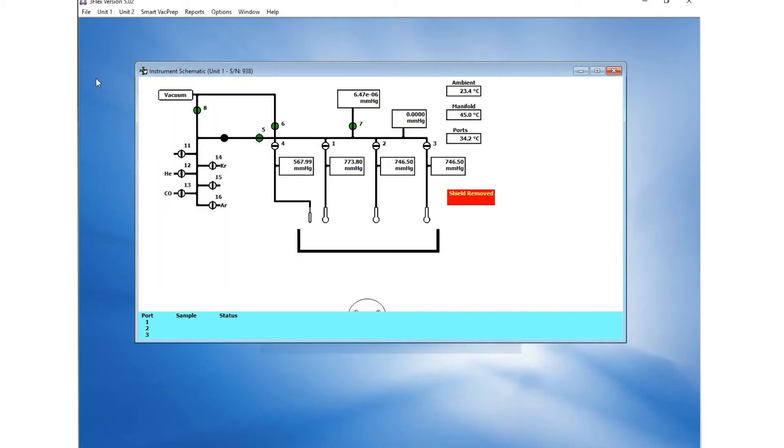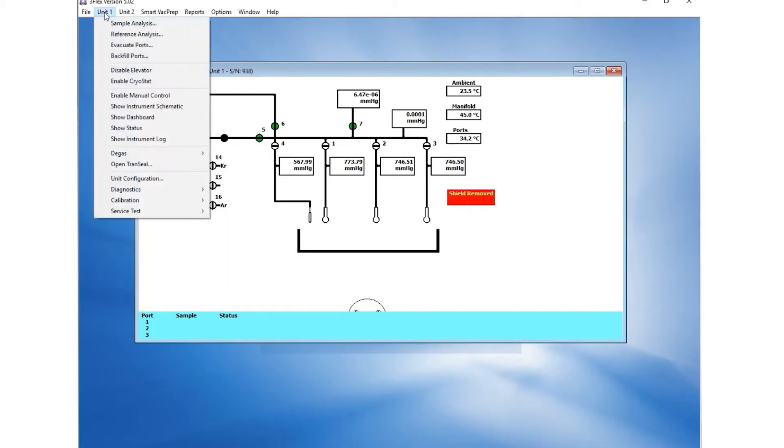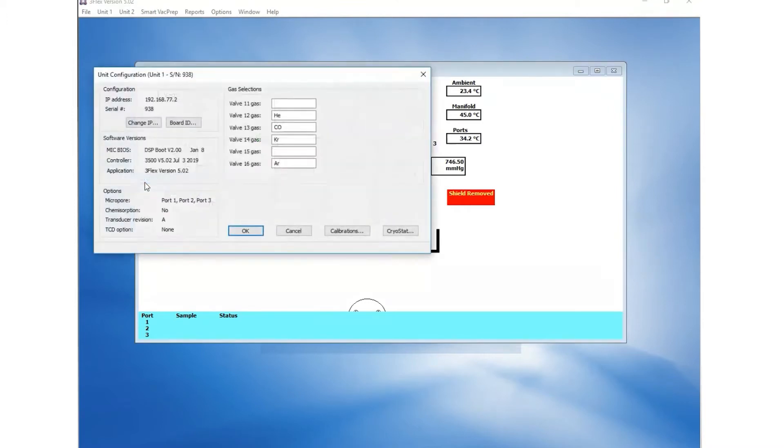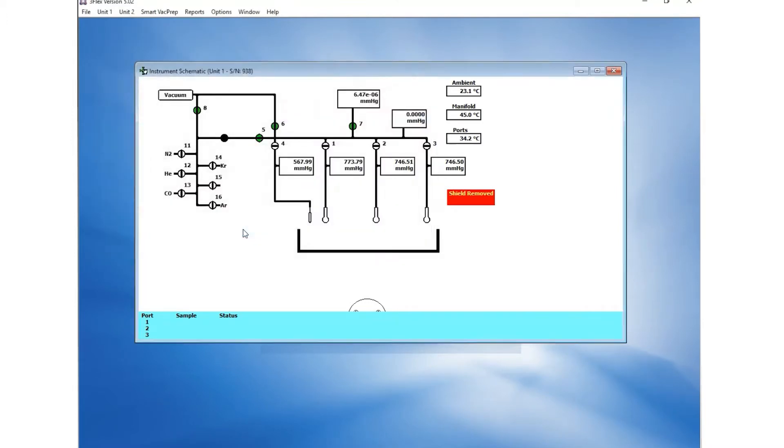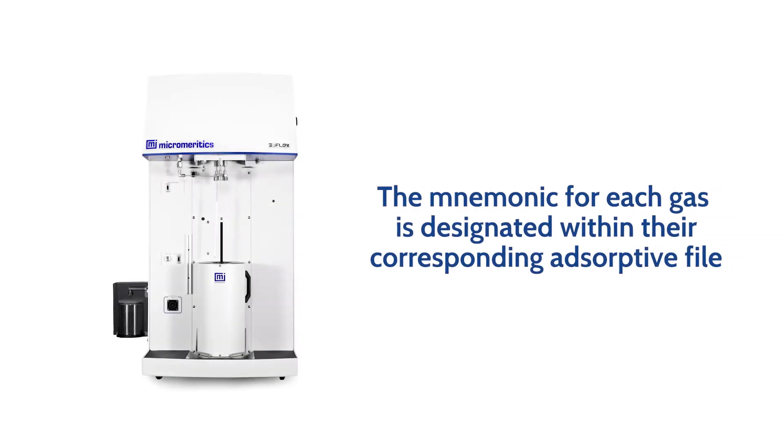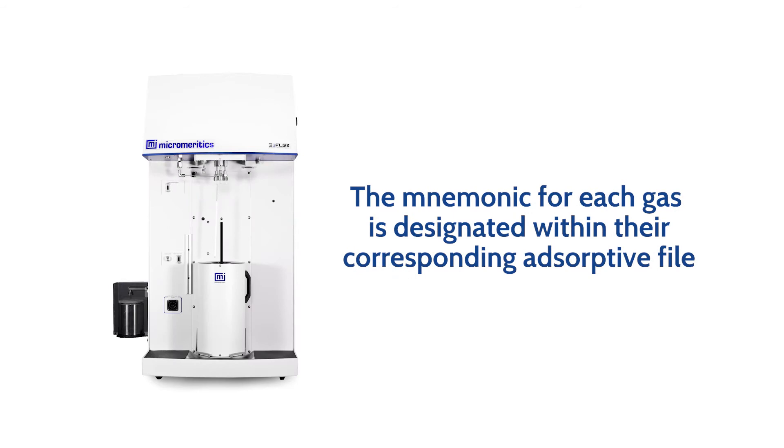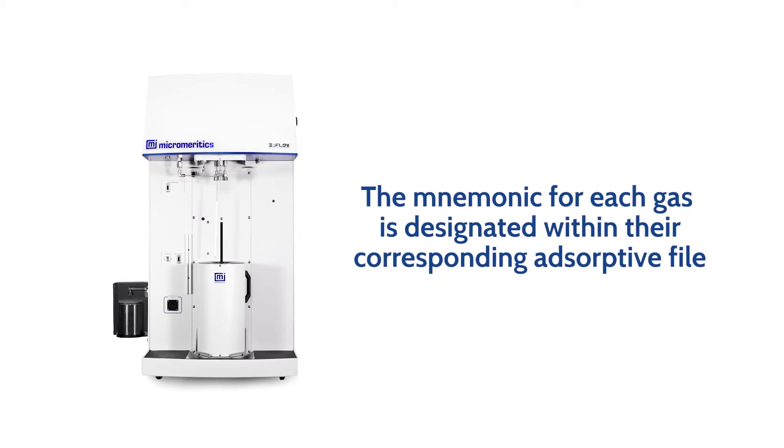In the 3Flex Microactive Software, go to Unit, Unit Configuration, and type in the mnemonic for the gas. The mnemonic for each gas is designated within their corresponding adsorptive file.